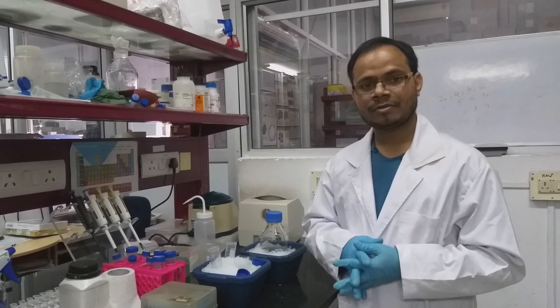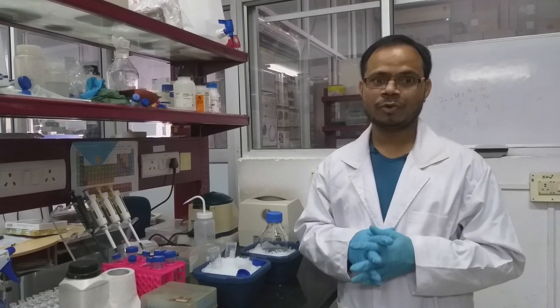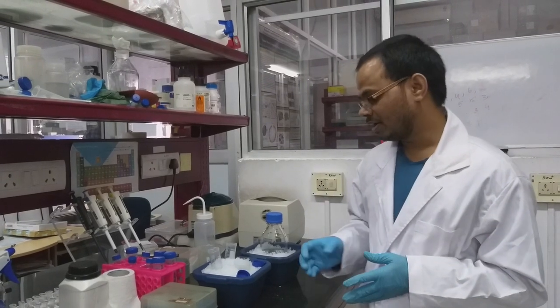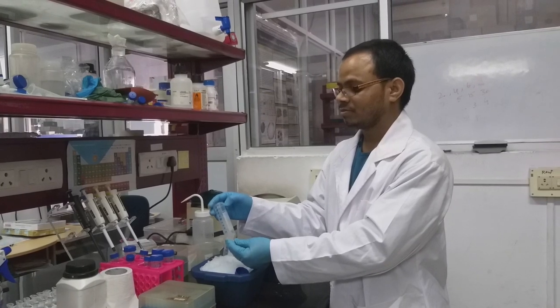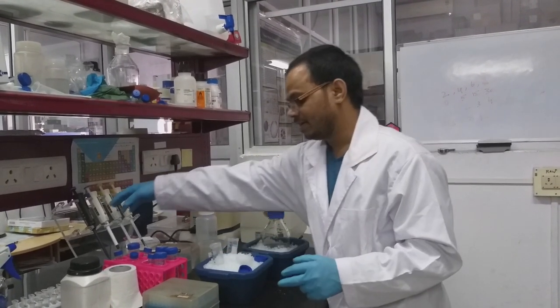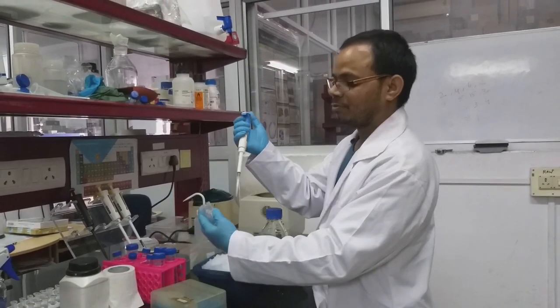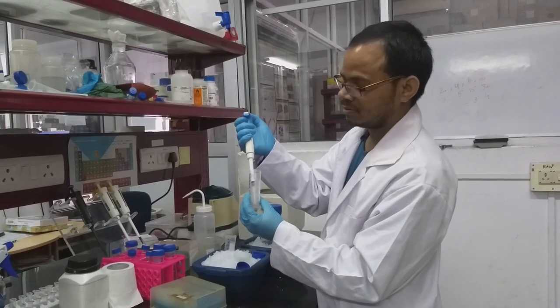In further videos we will show how to purify this protein using a nickel NTA column. So for now, after pelleting down, we have to add lysis buffer to the cells and resuspend the pellet in lysis buffer.